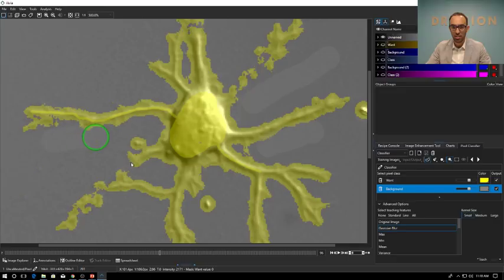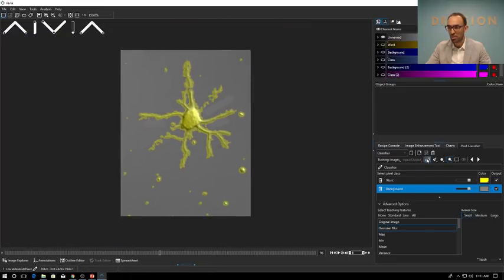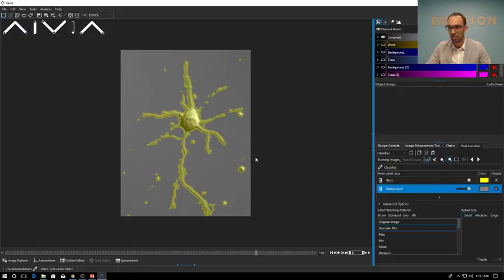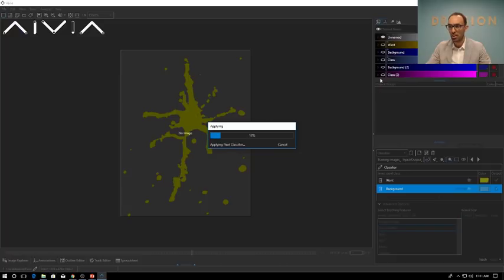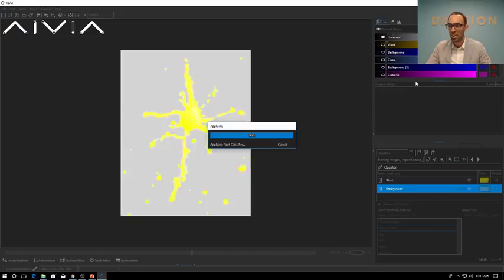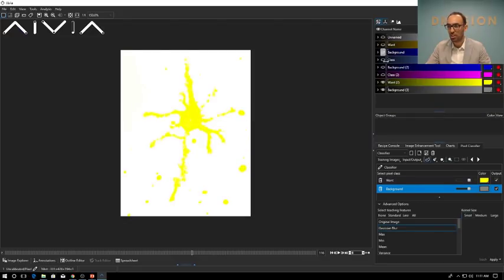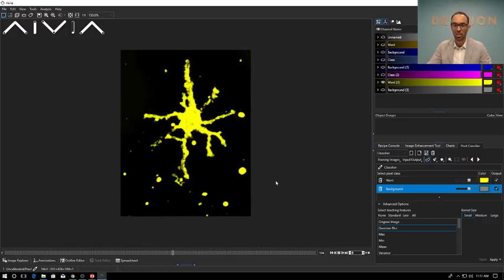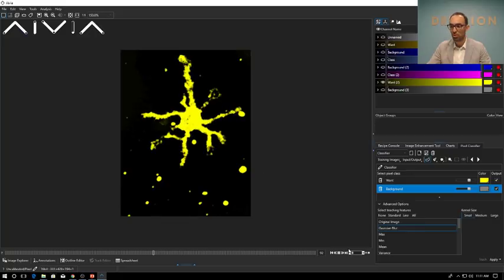Okay. And yeah, that's what the original looked like. So if you play through, it kind of gets longer, it's growing. And if we have the preview on, that's what it looks like. Then you can teach, apply it, and in fact, I had already run this, so now I'll have even more channels here. But you will get the new channel, it's this last one that shows that highly enhanced image, very high contrast, which you can then use for segmentation.